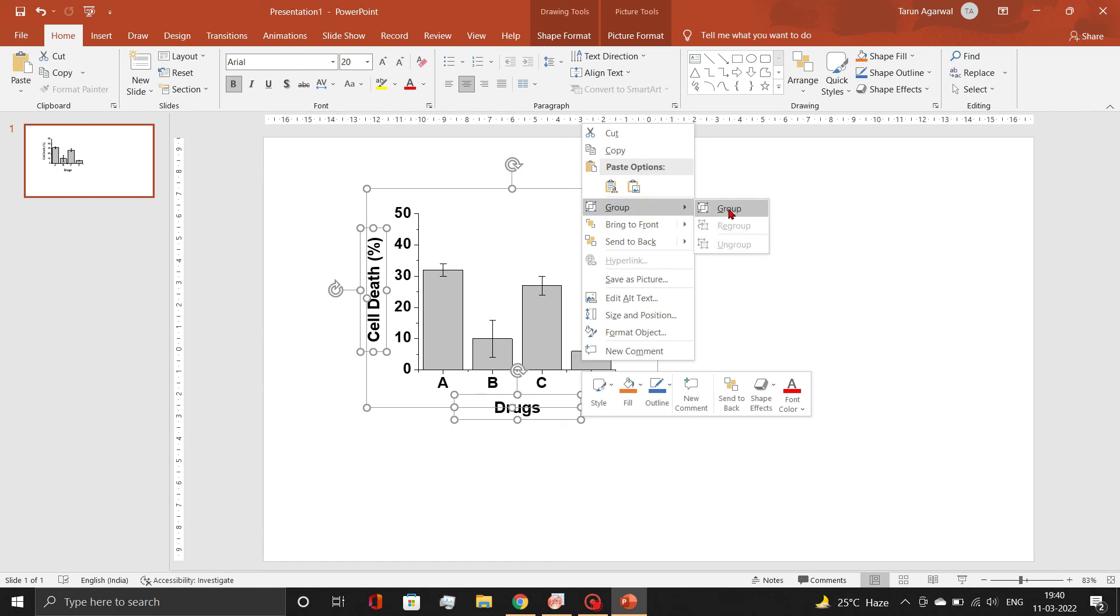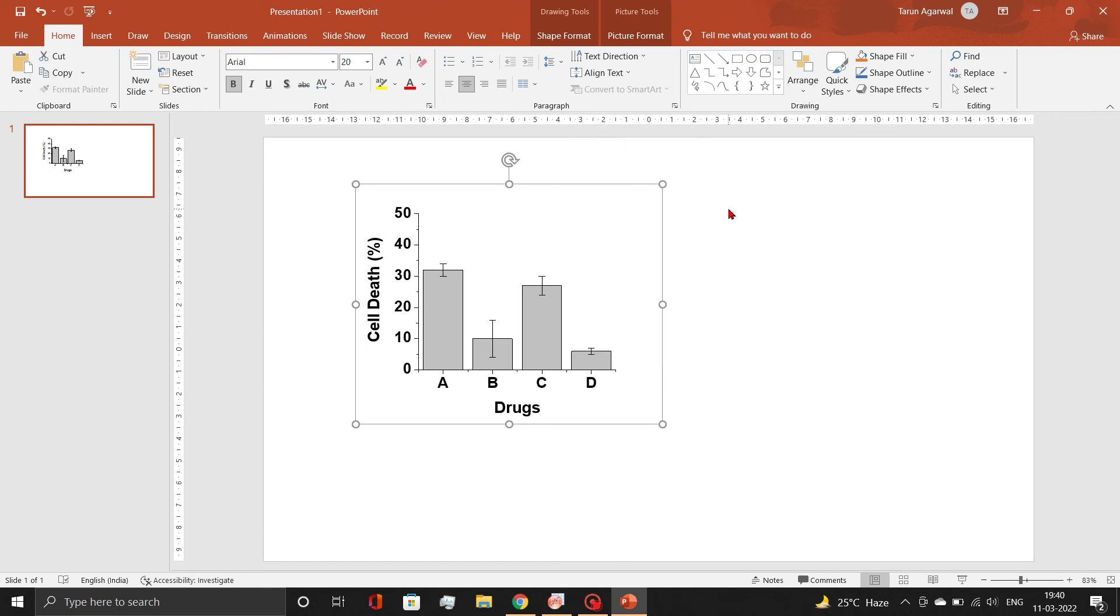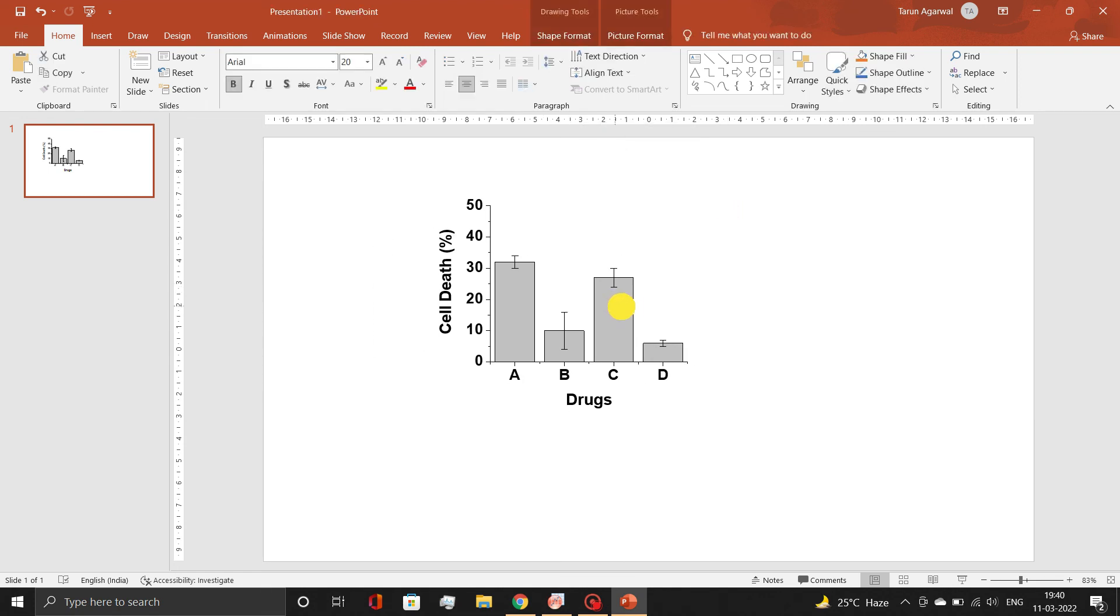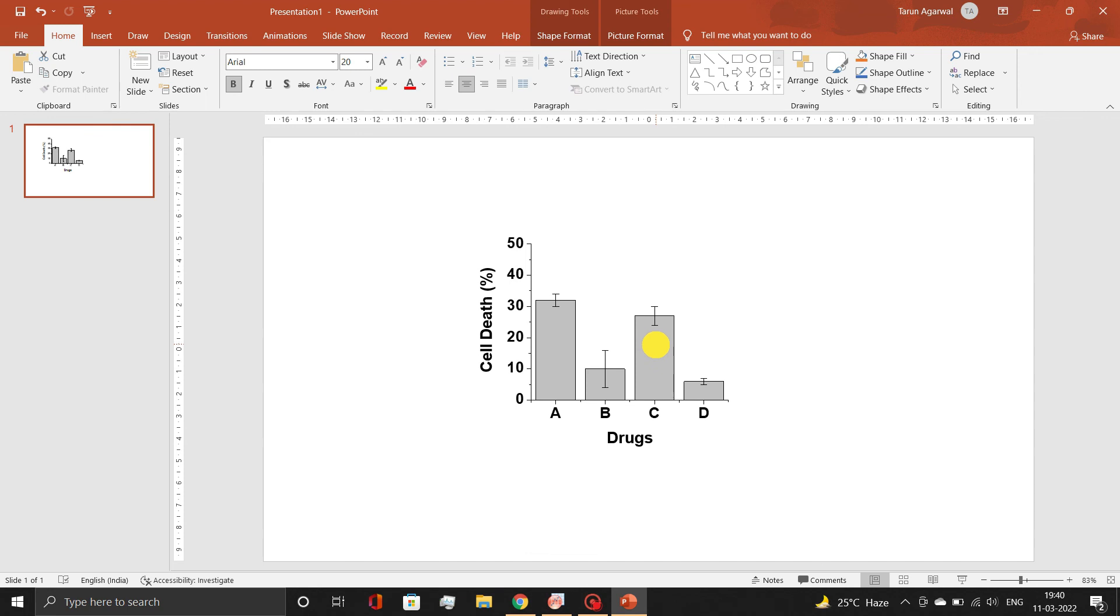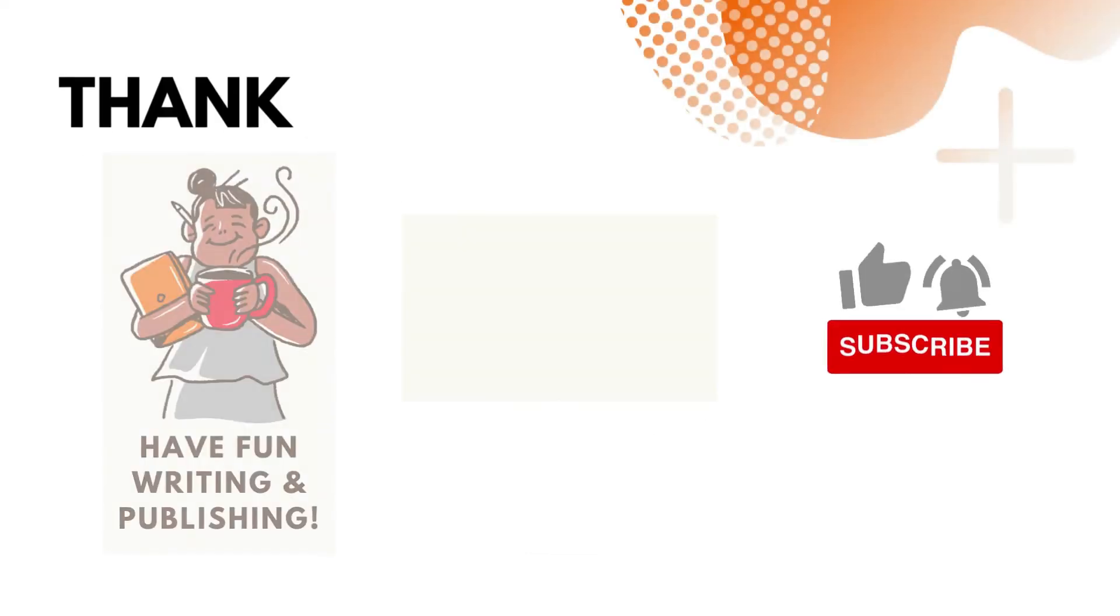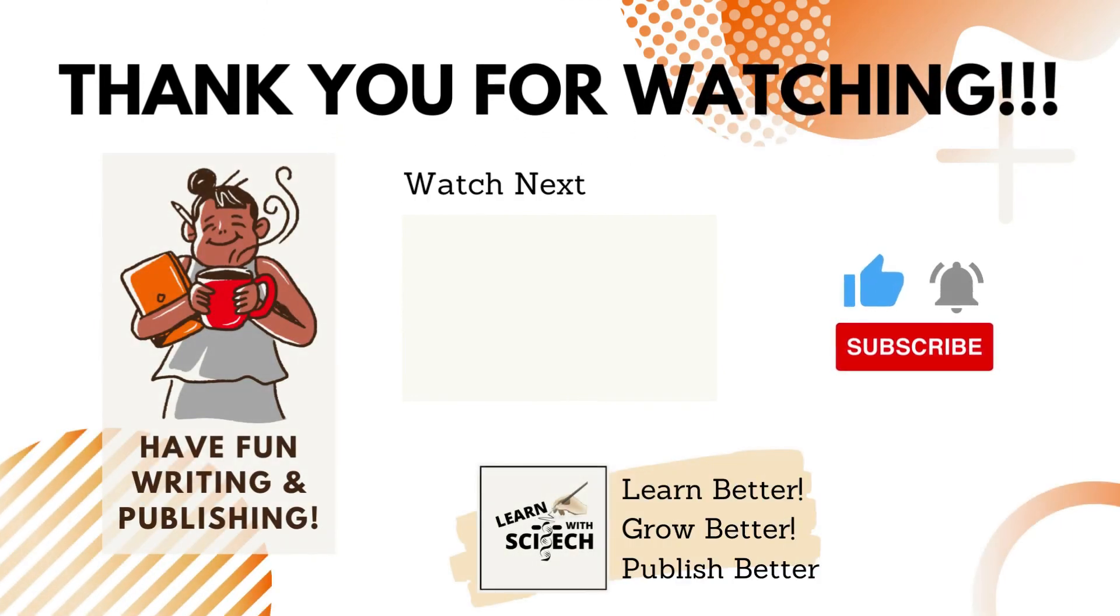You can use this graph in figure panels of your publication. Check out our previous video to know why we recommend to change the canvas dimension size before exporting graphs. Thank you, and all the best.